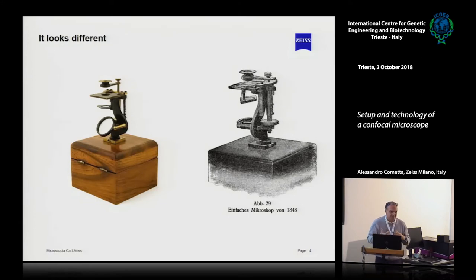Unfortunately, producing this kind of microscope was really, really complicated. There was no theory, just a trial and error process. The idea was to put together two lenses and more or less understand what is the best result. This meant a lot of time and was money consuming. So the microscope was not cheap and was complicated to produce. You can imagine that for a German mechanic, able to tweak everything and have everything exactly the same, it was not possible.